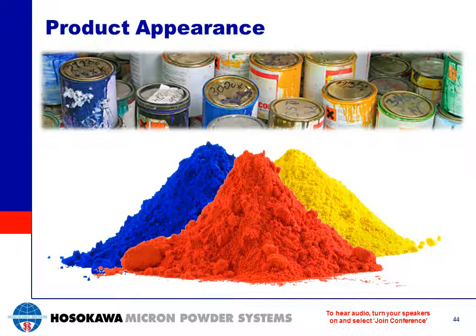Believe it or not, some companies don't require to know the actual size of a particle in a material. Toner companies will perform an optical confirmation when performing this particle size analysis. Just by looking at the grain content that's retained on top of the test sieve screen, toner companies can determine if their product has an even consistency. And again with paint manufacturers, particles will scatter light in different ways depending upon their size. Paint manufacturers must achieve desirable light scattering effects in order to define parameters such as the tint on your car or the glossy finish in your dining room.